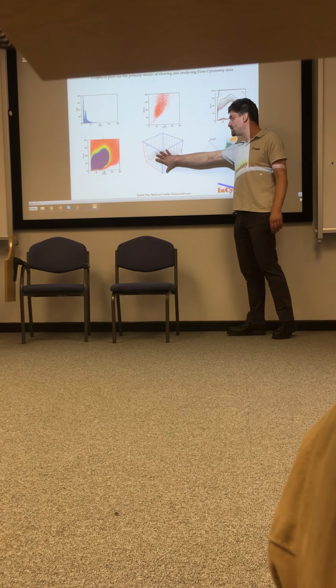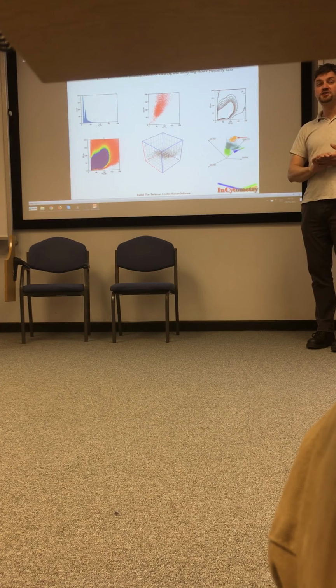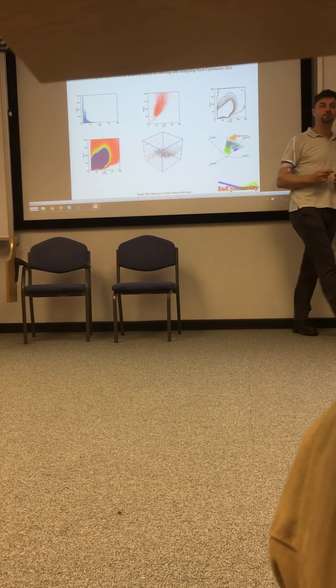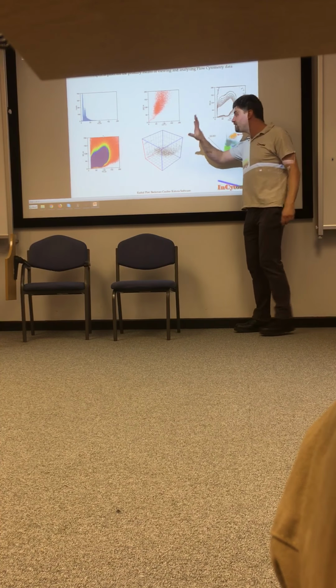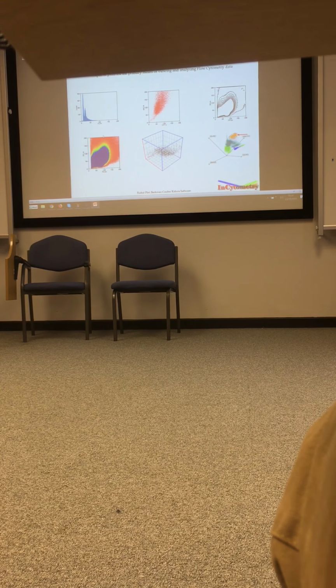So 3D plots, I can't show you, but they're great if you can get them rotating and you can show populations appearing, disappearing, and so on. If you're doing a presentation, a conference talk, anything like that, fantastic. Use 3D plots, they're brilliant. If you're going to put them flat on the page, don't. Because that's like one of those weird optical illusions. If you look at it, is the blue point at the back or at the front? If you stare at it hard enough, it seems to flip backwards and forwards. Or mine does anyway, my brain does. It's very, very hard to read a 3D plot flat on the page. So I wouldn't ever put them flat on the page, but if you can get them animating, they're brilliant.